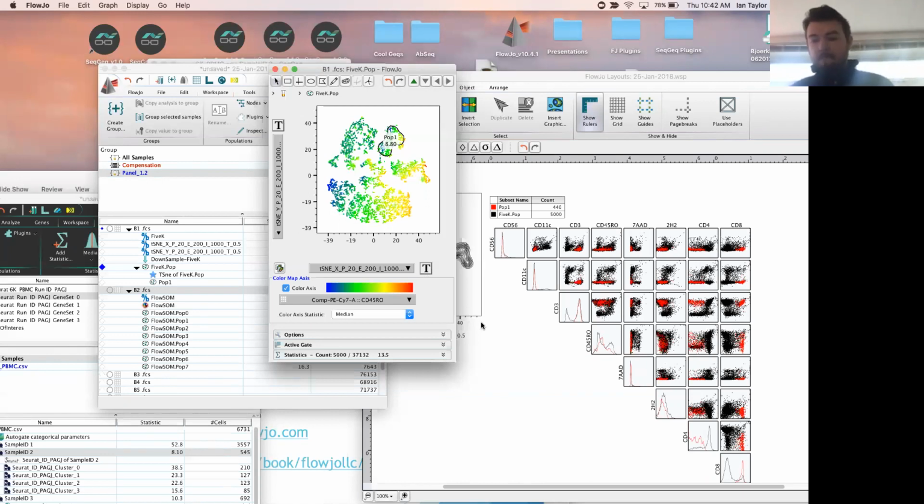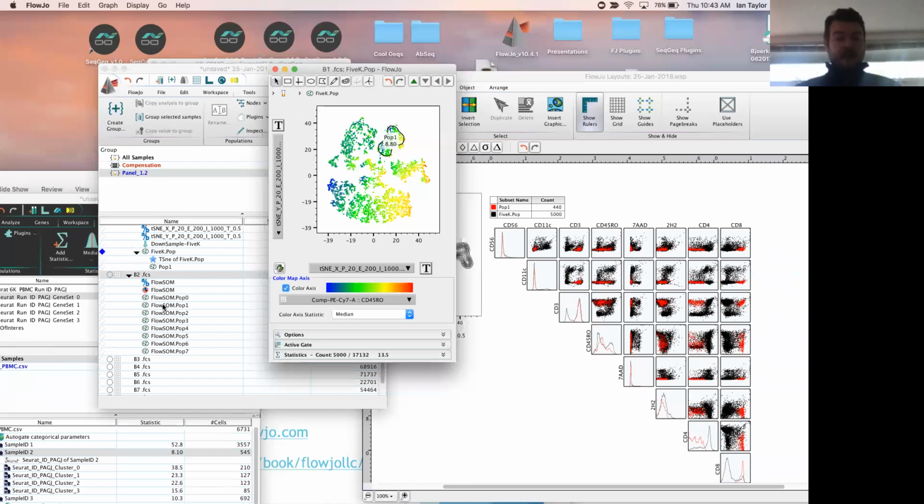Oh, yeah, I think this is so. Questioner: Can I statistically analyze differences between the t-SNE populations after having done t-SNE on a concatenated FCS file that I got by concatenating 2 groups of samples? Yeah, so another really great question. You absolutely can, and I would like to demonstrate that for you now.